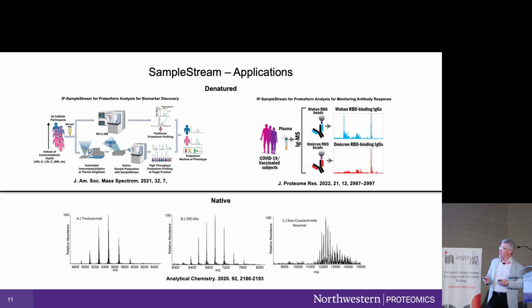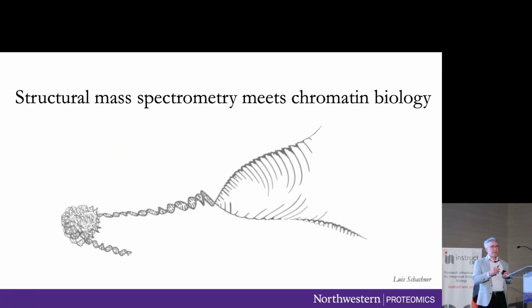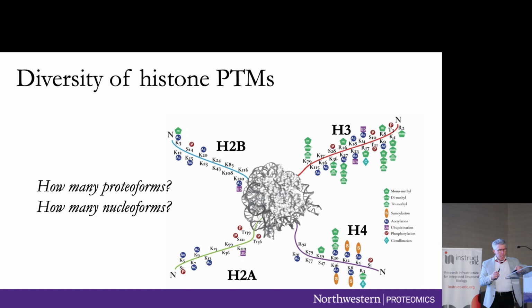Well, what most of you are interested in, I think, is the native mode of analysis. And so let me get to that, focused on chromatin, an area, of course, that's rife with a lot of activity looking at complexes bound to those nucleosomes. But as I mentioned, the talk's really about the decorations on proteins and how to find them more efficiently and the functional PTMs for people after. So chromatin is a great space where it has been theorized for decades, since 2000, that combinations of these modifications co-occur to really drive all the central processes of gaining access to the genome, transcribing it, replicating it, etc.